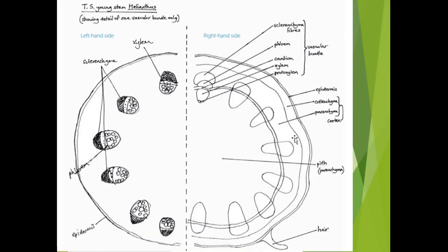Now here's an image of some common misconceptions and some mistakes that people make, and I'll clarify in a minute. Now on the left hand side, this is an image of a student's biological drawing where they've shaded and sketched, so this is not what you should be doing. Now this particular example is a tissue drawing, so you're trying to draw entire tissues rather than individual cells. So this person has started drawing lots of little cells on the inside, and you can see they overlap, but it's not very clear. They've sketched the line on the outside.